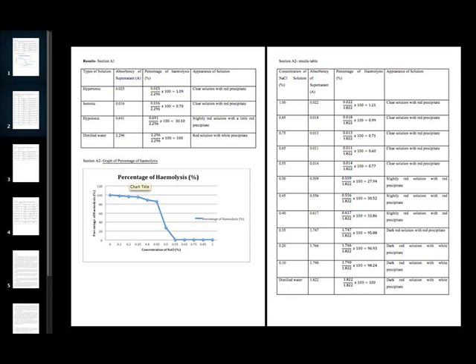from the erythrocytes. In hypertonic solution, the higher concentration of solute outside the cell causes water to move out of the cell down its concentration gradient. This is known as crenation. The supernatant remains colorless as hemoglobin is trapped within the cells, and red precipitate can be seen at the bottom of the test tube after being centrifuged.